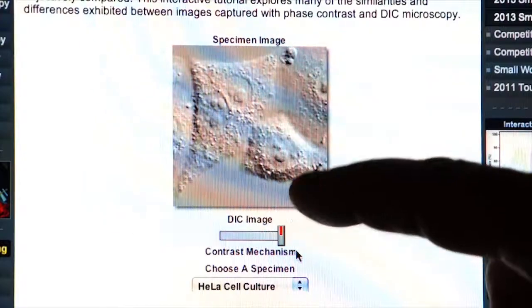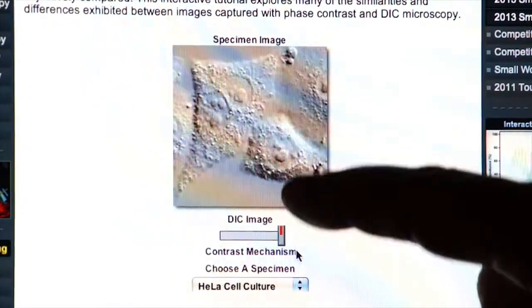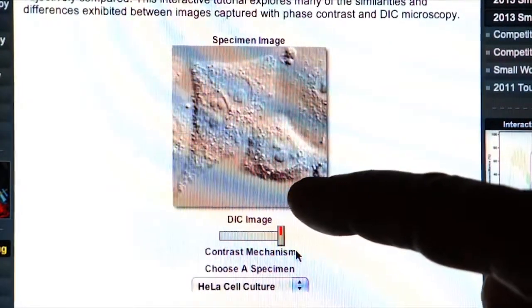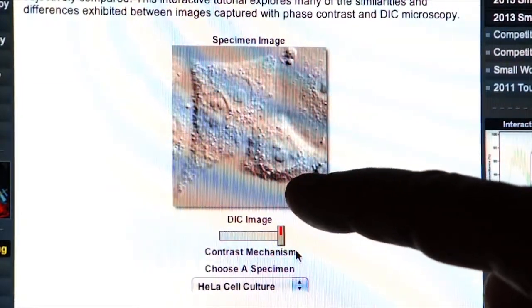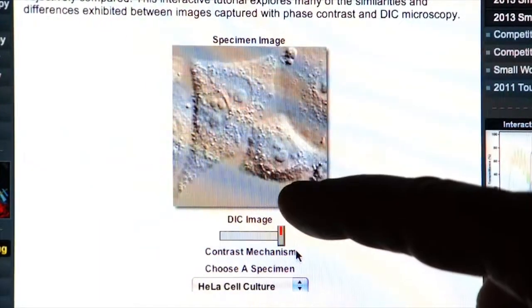So your preferred methods of illumination and viewing in transmitted light are DIC and bright field. Before we end this session, I wanted to show you, using the computer screen, the difference between DIC, or differential interference contrast, and bright field microscopy.